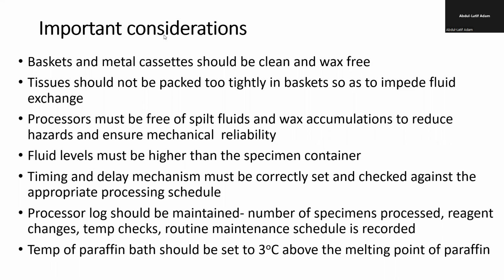And you also note the number of samples you are running so that you'll be able to check that, if I run, let's say 1,000 tissues, then the color or the potency of the chemical changes. So then after every 1,000 cases I change the chemical, or after every 100 cases I change the chemical.